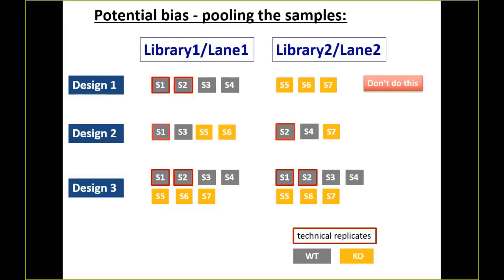I guess you wouldn't know for sure where the mistake happened. It could have happened during the preparation of the library. Exactly. And as I say, another possibility is the technician in the core who was doing the library prep may have sneezed in library prep number 2. That's also a possibility. I wouldn't be able to detect it there.